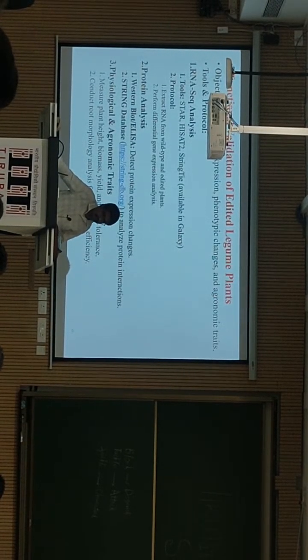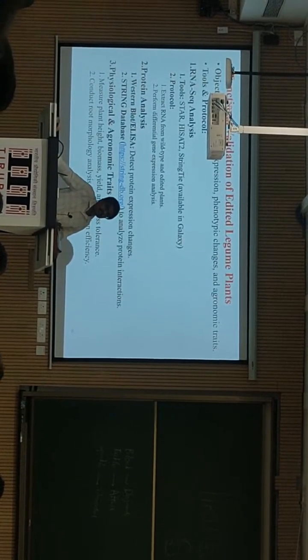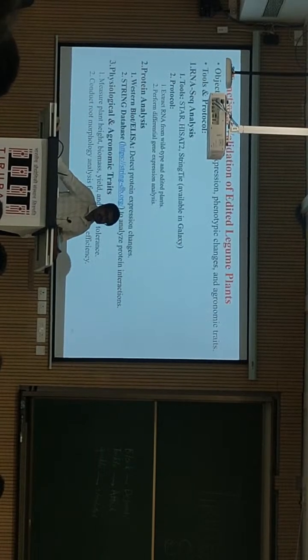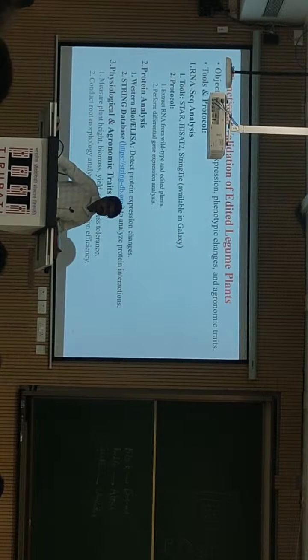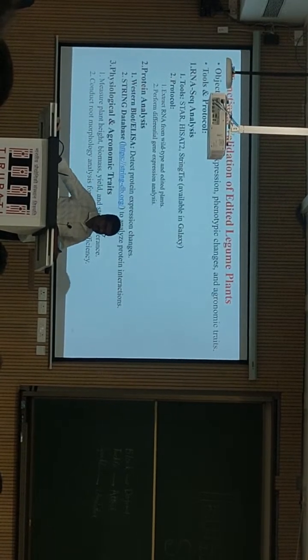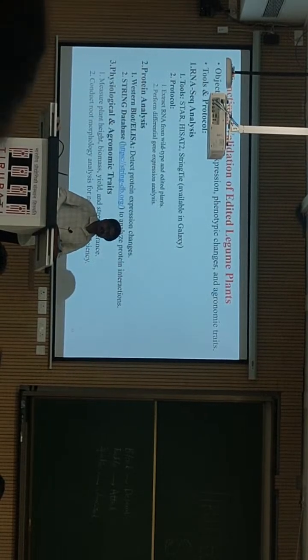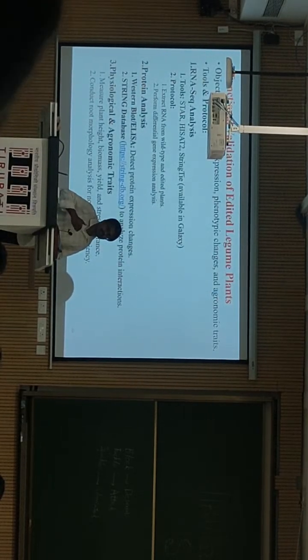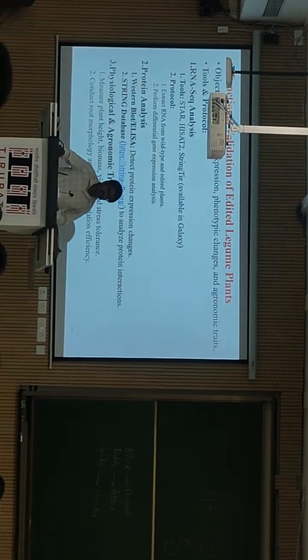We have done the experiment and got the results, but we need to check the physiological parameters in the aspect of plants. That means we need to quantify the respective auxin content present in the shoot followed by the root. Then only can we compare how much auxin was synthesized in the shoot and then transported to the root.